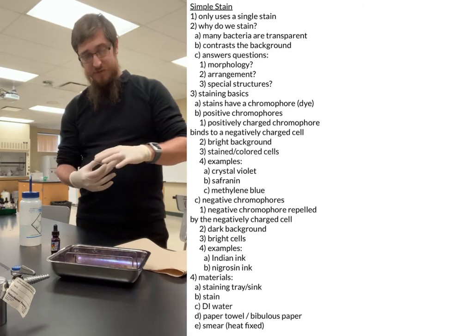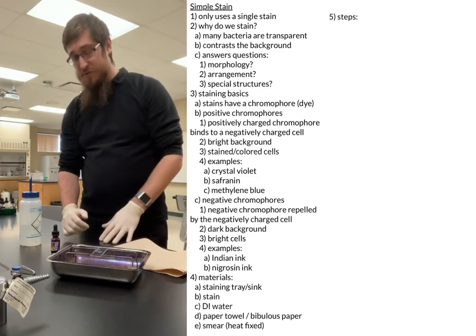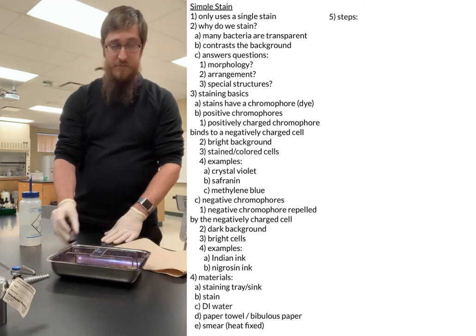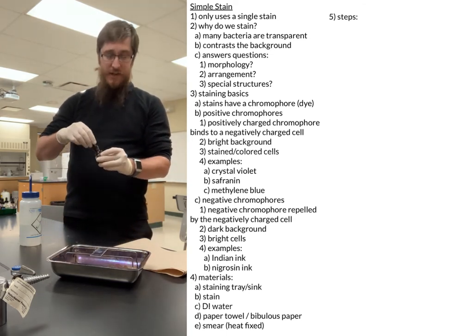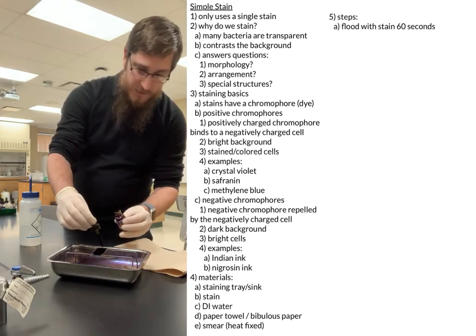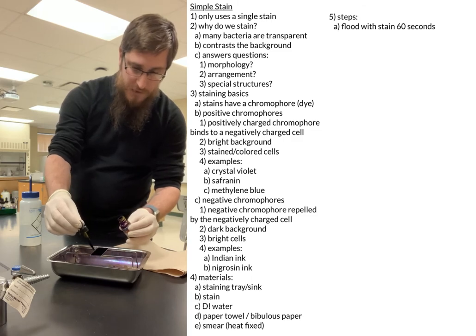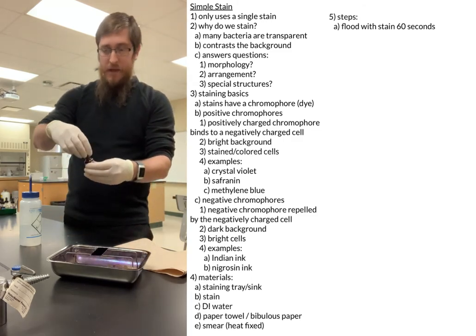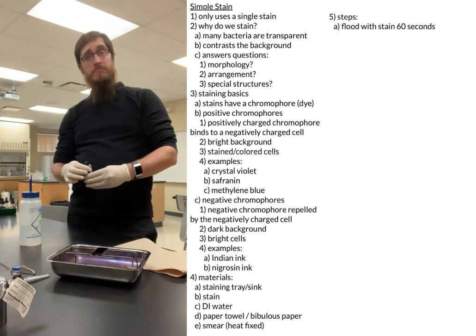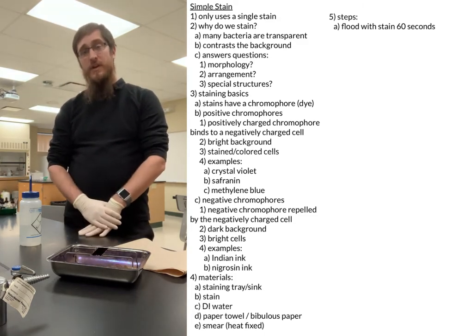So let's go through how this works. It's really straightforward in terms of the procedure. Put your heat fixed smear in the staining area, and then you're just going to flood the slide. When we say flood the slide, we mean cover the whole thing. So you cover the whole slide, and now we wait. You basically just wait 1 minute for this procedure.